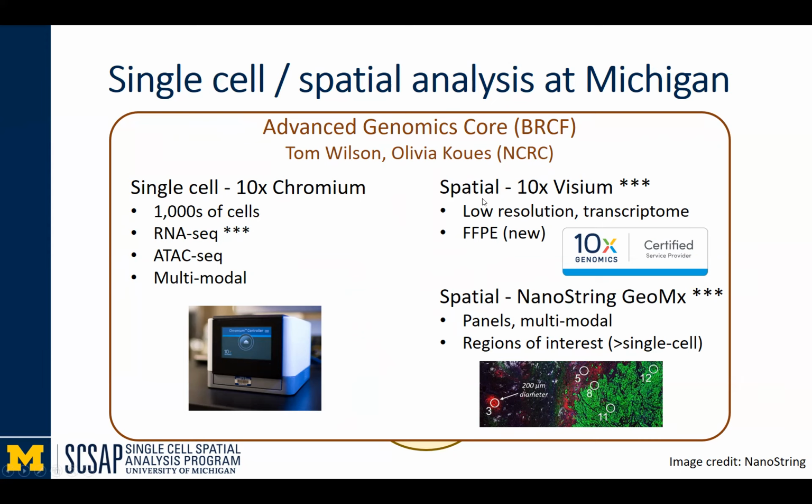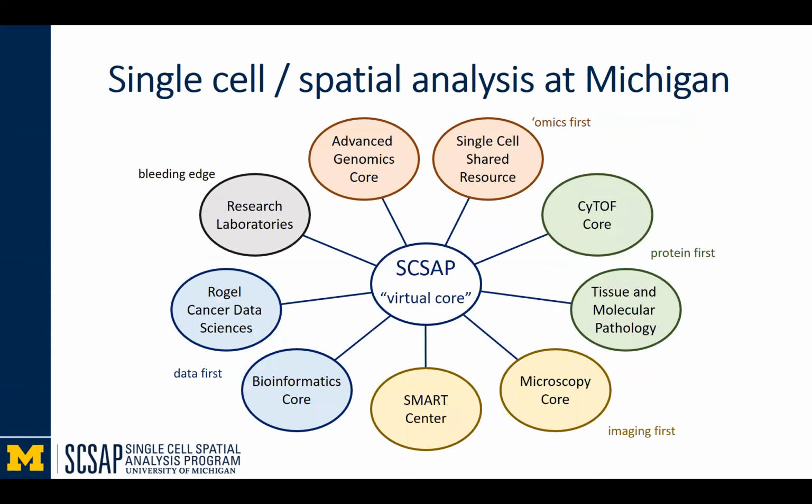In the last 2 years, we've been really seeing this single cell push expanding into spatial. So we are not only offering the 10x Visium platform, but we are one of the few certified service providers in the country, which gives us early access to things like, for example, the newest FFPE tissue processing capability. More recently, the program has helped purchase the NanoString GeoMx platform, which we are now live on. And it has various features that, again, you'll hear about in a talk coming up. But I'll just quickly mention that it has a unique property of all the technologies of being really good at doing region of interest selection so that you can target your analyses.